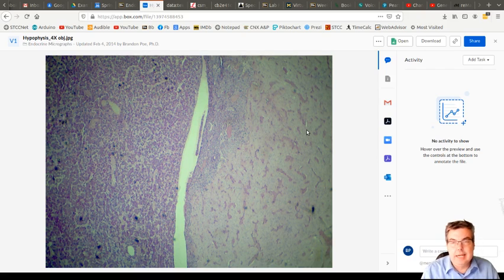When you dehydrate the tissue, like I described in the previous video, the tissue shrinks. It's stuck to the glass, so it's not going to just all shrivel in from the outside towards the center, but rather each little part of the tissue is going to shrink to itself. And so the 2 halves of the pituitary gland shrivel up and pull away from each other. And we can actually see that physical separation because it pulls apart at the weak point of the tissue, which is where there's a transition from one type of tissue to another.